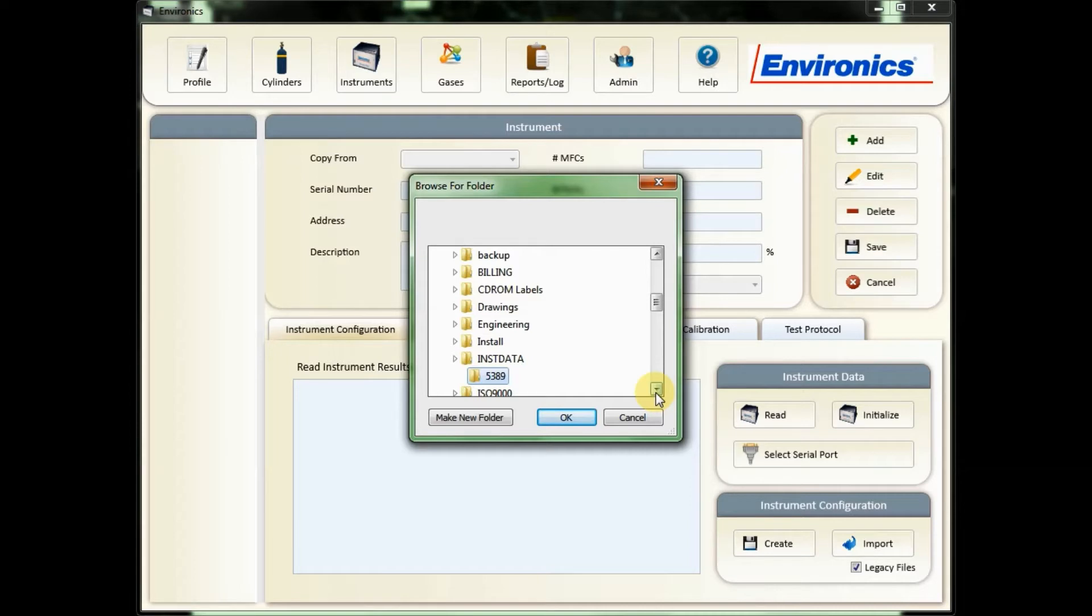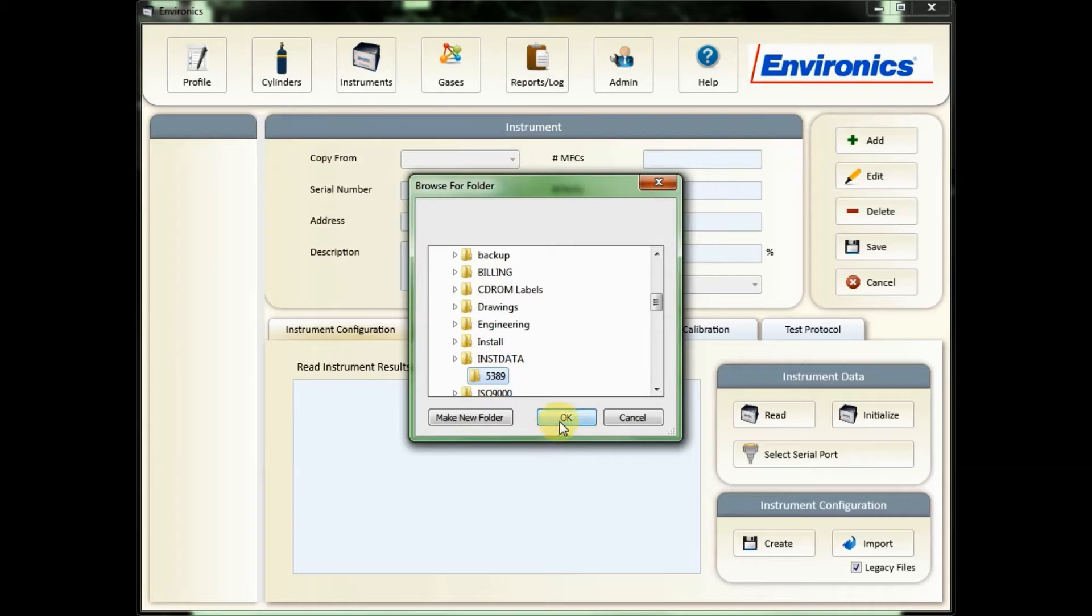We always recommend that folder be named the serial number of the unit. Once you find that folder you're going to click OK.